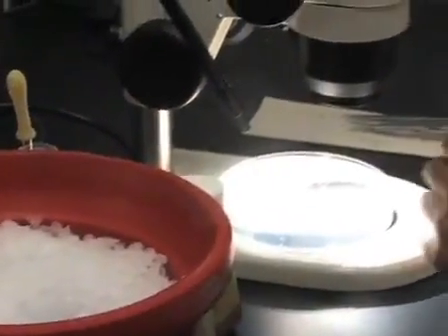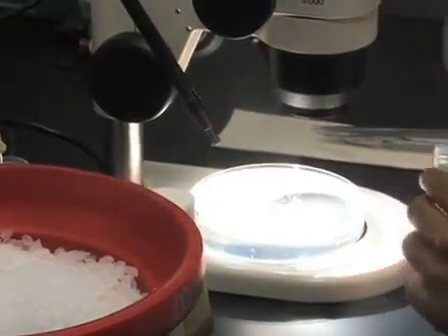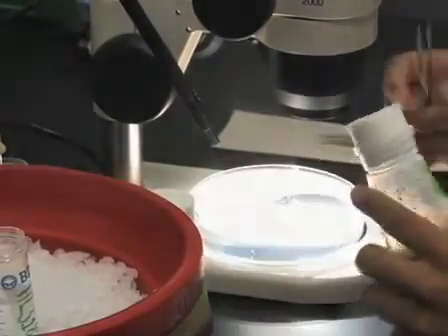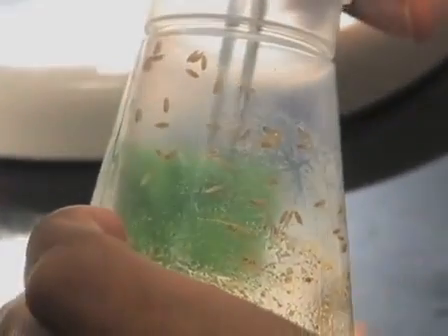Begin the procedure by putting a drop of HL3.1 buffer onto a dissection plate. The buffer is made in advance and cooled on ice. Carefully pick a wandering third instar larva from the side of the vial using large SS forceps. The movement indicates that the larva has not entered pupation.